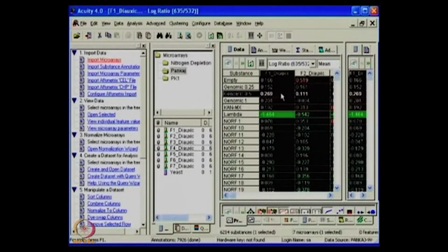When I am looking at the data, you expect that when the green and red channels are both giving the same color, the same intensities, it becomes blackish in color. If they are upregulated, people put them towards the red color, and if it is downregulated, a minus sign will be given and that will become downregulated. The idea with this is which laser is being used for what.